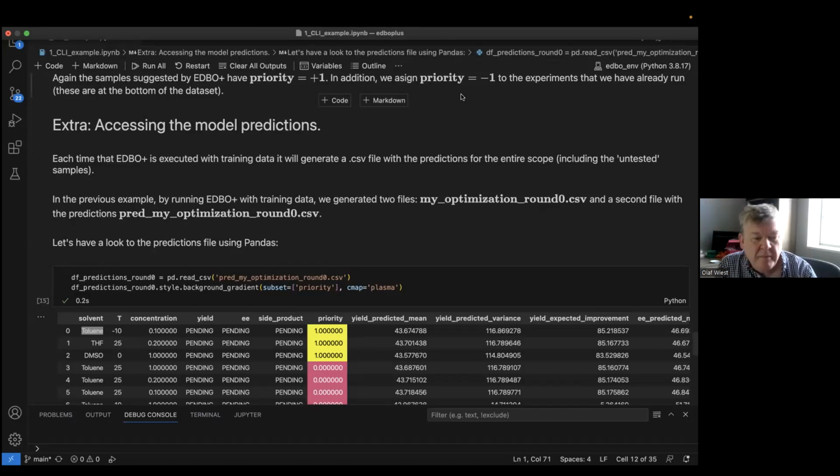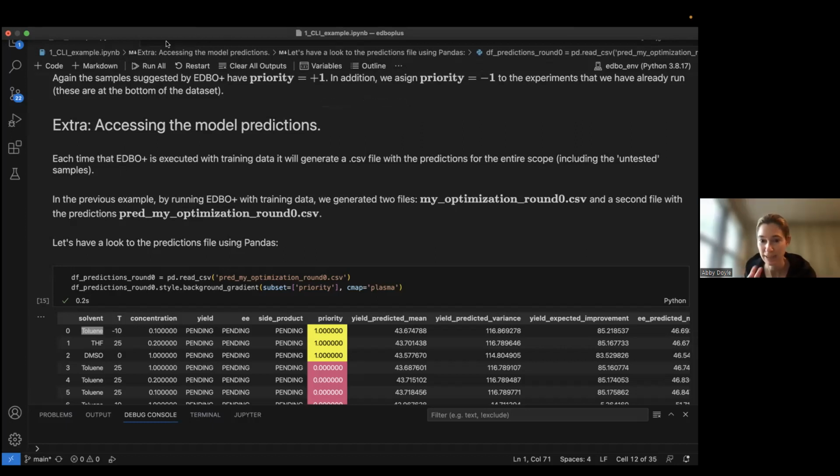Yes. I'm thinking more of a novice user trying to get a feeling for what am I getting myself into, or as you said, what is impractical. If I'm trying to optimize everything from ligands to solvents to temperatures to generate a huge search space, you still pay a price for that. For sure. We tend to keep things to 500,000 or less in terms of the search space when we've been using it.